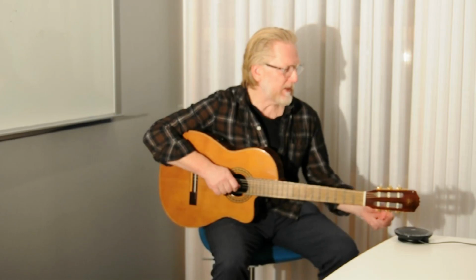The oscillations of the atoms within a molecule depend on the binding energies between the atoms. You may think of the binding energy as corresponding to the strength that I'm applying to a guitar string. If I increase the strength, then the frequency of this vibration will also increase. If I reduce the binding energy, or the strength of the string, then I will also reduce the frequency. So again, the different spectrum of vibrations of different molecules will create unique spectral signatures of each molecule that is present in the material. This is what makes vibrational spectroscopy so interesting.